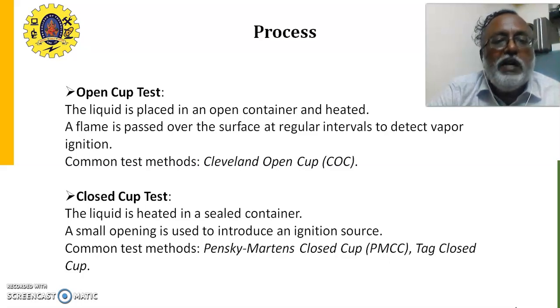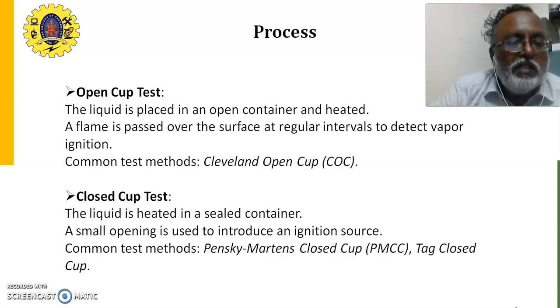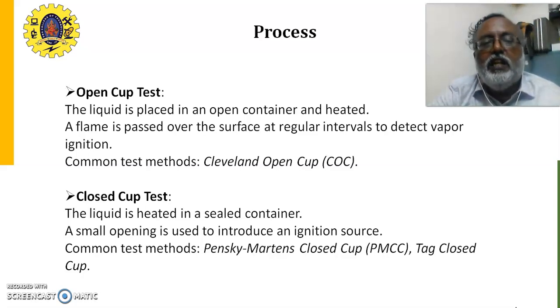A flame is passed over the surface at regular intervals to detect the vapor ignition. A common test method is the Cleveland open cup.